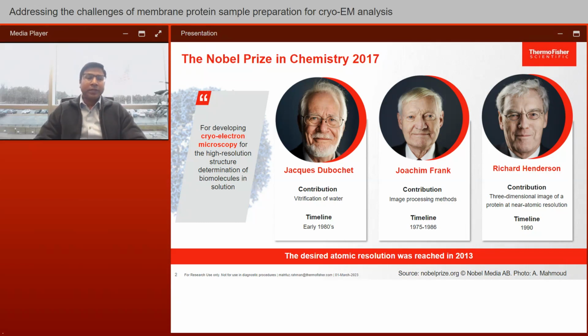In 2017, when I was in my 4th year of doctoral studies, there was a huge recognition in the structural biology field for developing cryo-electron microscopy. The Nobel Prize was shared among Dubochet, Frank, and Henderson. Dubochet developed a method to keep the biomolecules in solution for cryo-EM application. He flash froze the biological sample in liquid ethane, where the liquid water solidified in its liquid form surrounding the biomolecules and retained the same condition as in the solution.